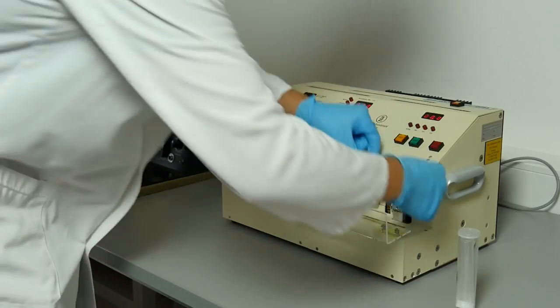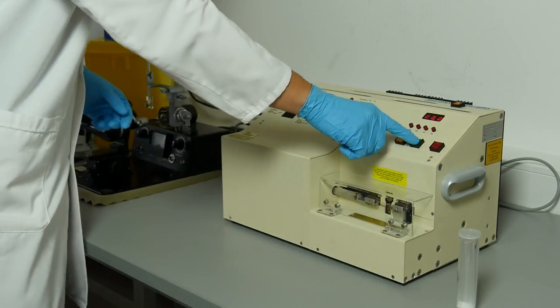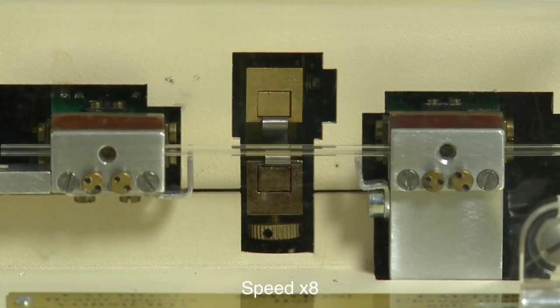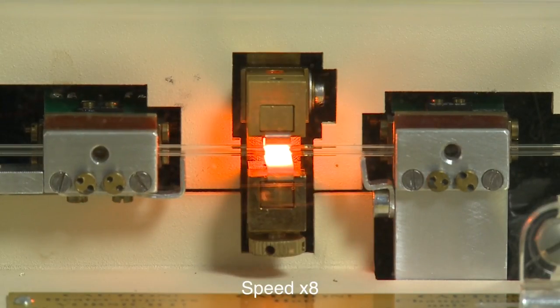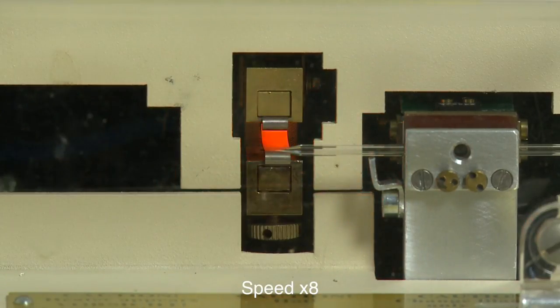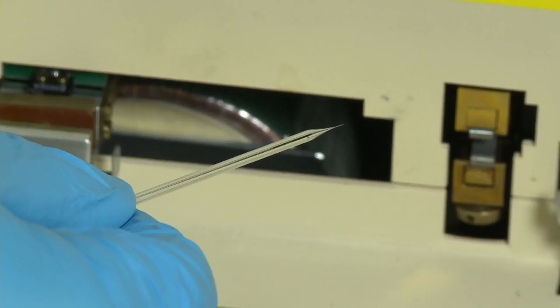We take a borosilicate glass capillary and place it into a pipette puller. The electric filament covers the middle of the pipette and delivers heat to melt the glass. The pipette is fixed at both ends and force is applied to pull the electrode. With enough heat, the middle of the pipette begins to melt and the pulling force causes lengthening and thinning of the glass capillary. After several rounds of heating and pulling, we obtain pipettes with a tip size of approximately 1 micrometer.